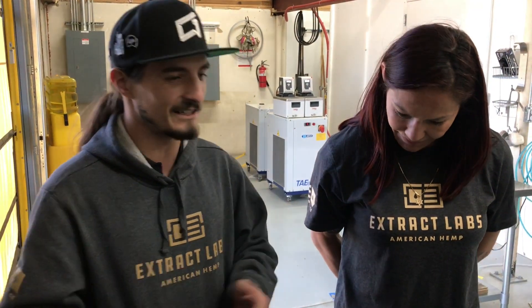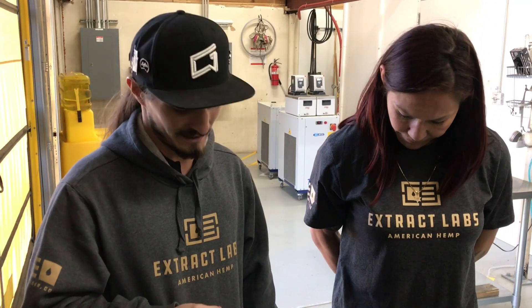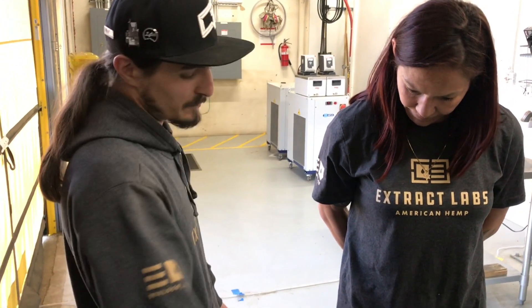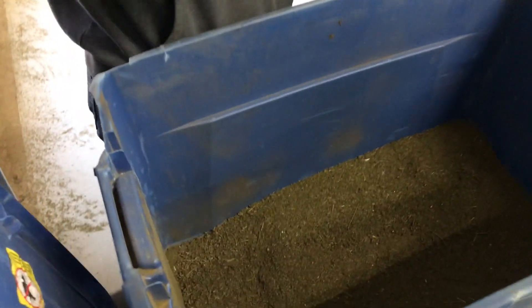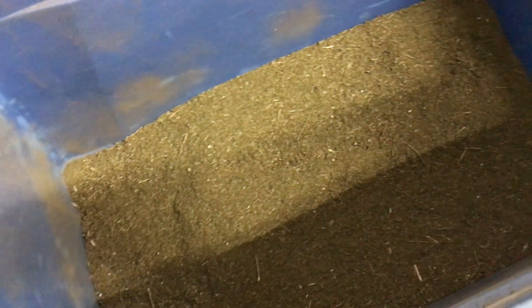It's not going to smell — well, it smells kind of like grass you have outside. It's got a little bit of terpenes in it. It's definitely not like marijuana where it smells really good. This will probably be about 10% CBD right here. And then we extract the oils out and it goes to about a 50% oil. We really like CO2 — you get the most minor cannabinoids out of it, a lot of terpenes. Medicinally, this is going to give you the best product.